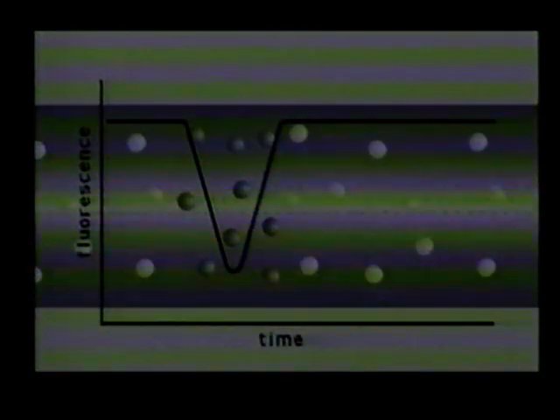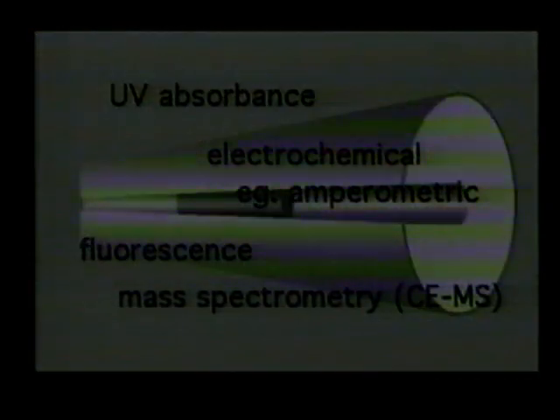However, to overcome this problem, a sample may be derivatized to give a fluorescent product, usually before the sample's introduction into the capillary. Alternatively, use can be made of indirect fluorescence. In this method, it is the buffer that contains the fluorophore, with the analytes detected as dips in the background level of fluorescence.